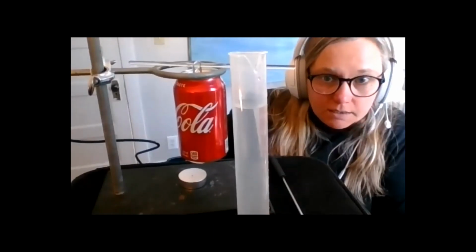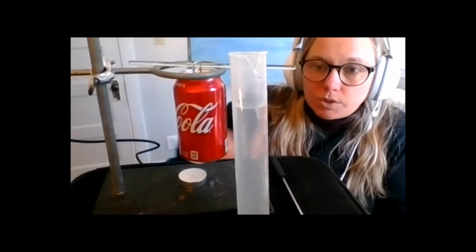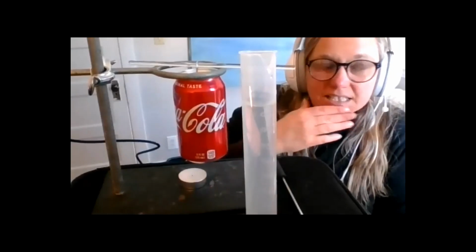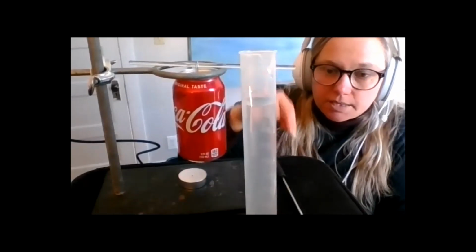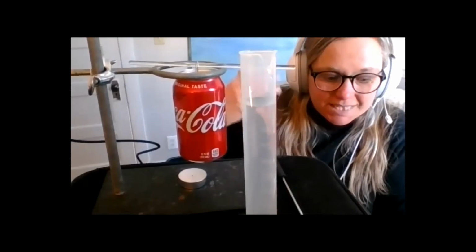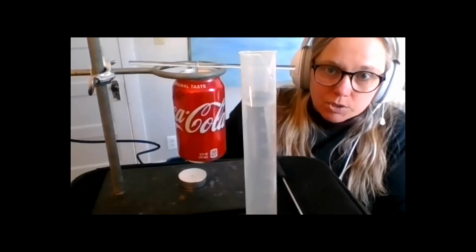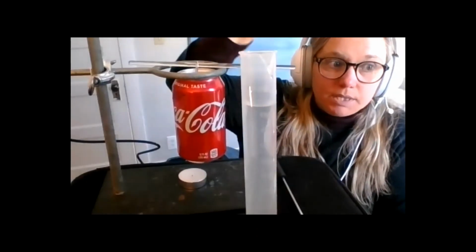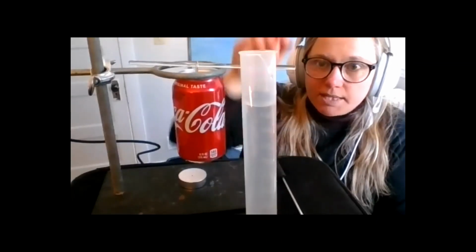It was 17 degrees C. So your water temperature should get cooled down to at least 7 degrees C if you were in my room. So I would want my water to be 7 degrees C because that's 10 degrees below room temperature. And then I would heat it up to 10 degrees above room temperature if I started there. So that's how you're going to do it.